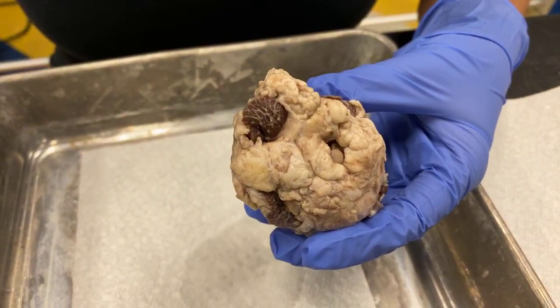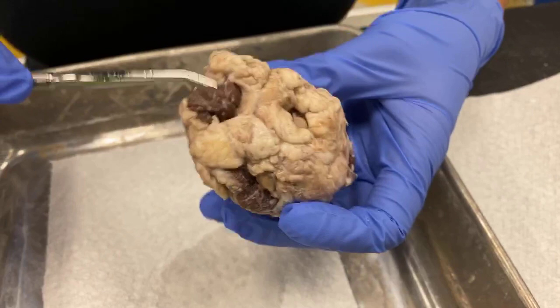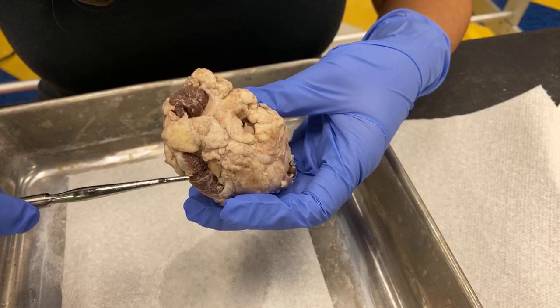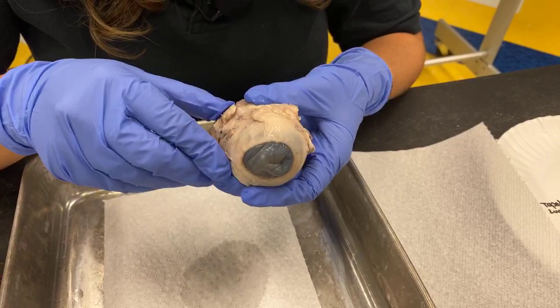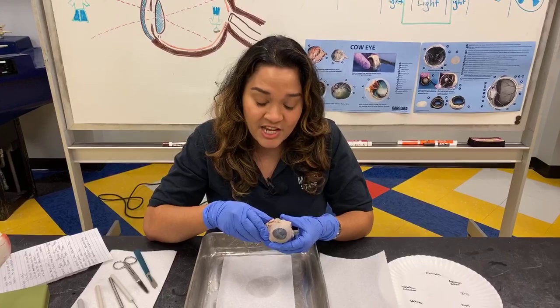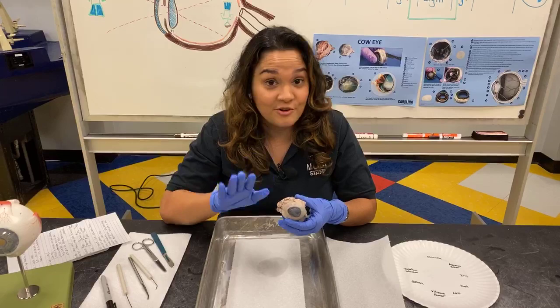And then I'll point out some dark red areas — there's one over here, one over here, and a tiny one over here. If you look closely, they might resemble ground beef, and kind of that's what they are. These are muscles — there are four muscles around a cow's eye that help the cow move its eye up, down, left, and right. Humans actually have six muscles, which allows us to roll our eyes. Cows can't roll their eyes — if you ever see a cow roll its eyes, walk away!